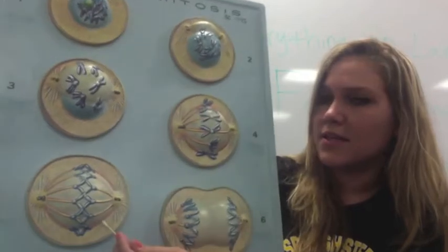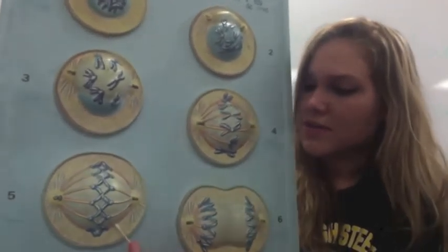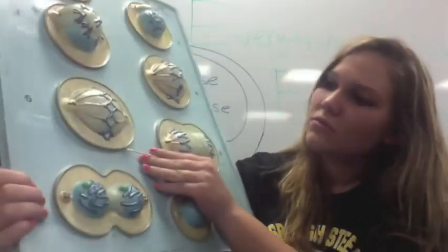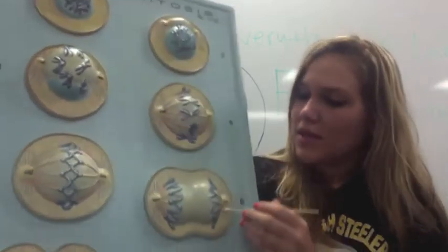This is early metaphase, and this is late metaphase.